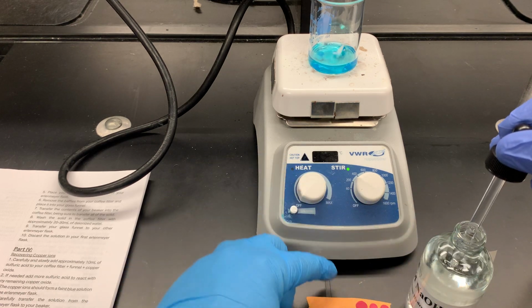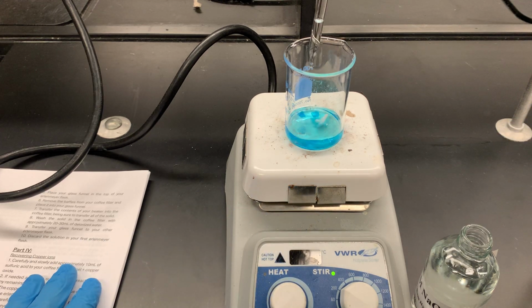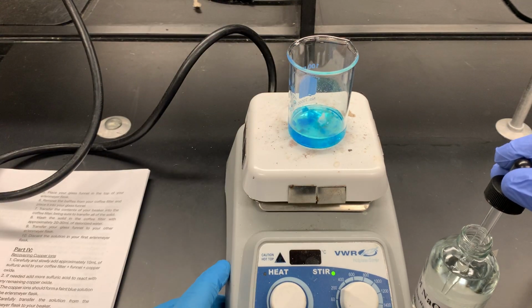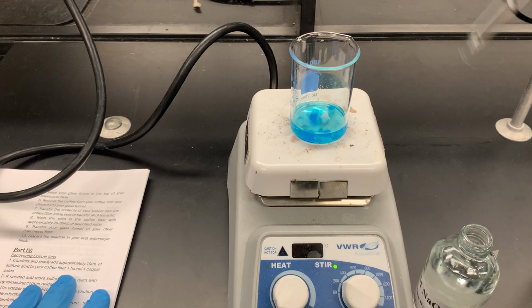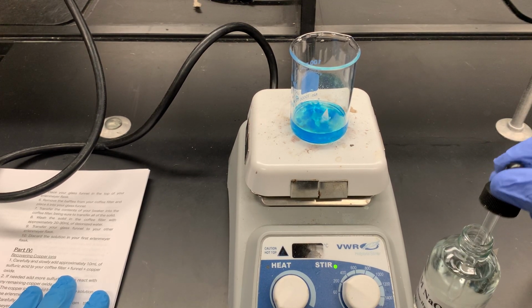What we're going to observe is that as we add more and more of the sodium hydroxide, the blue hue to our solution is going to dissipate. And instead, we're going to get more and more of this solid precipitating. So it's not too surprising to me that my solution's basically just as acidic as it started. I'll add more and more of my sodium hydroxide, and I'll see more and more of that solid form.